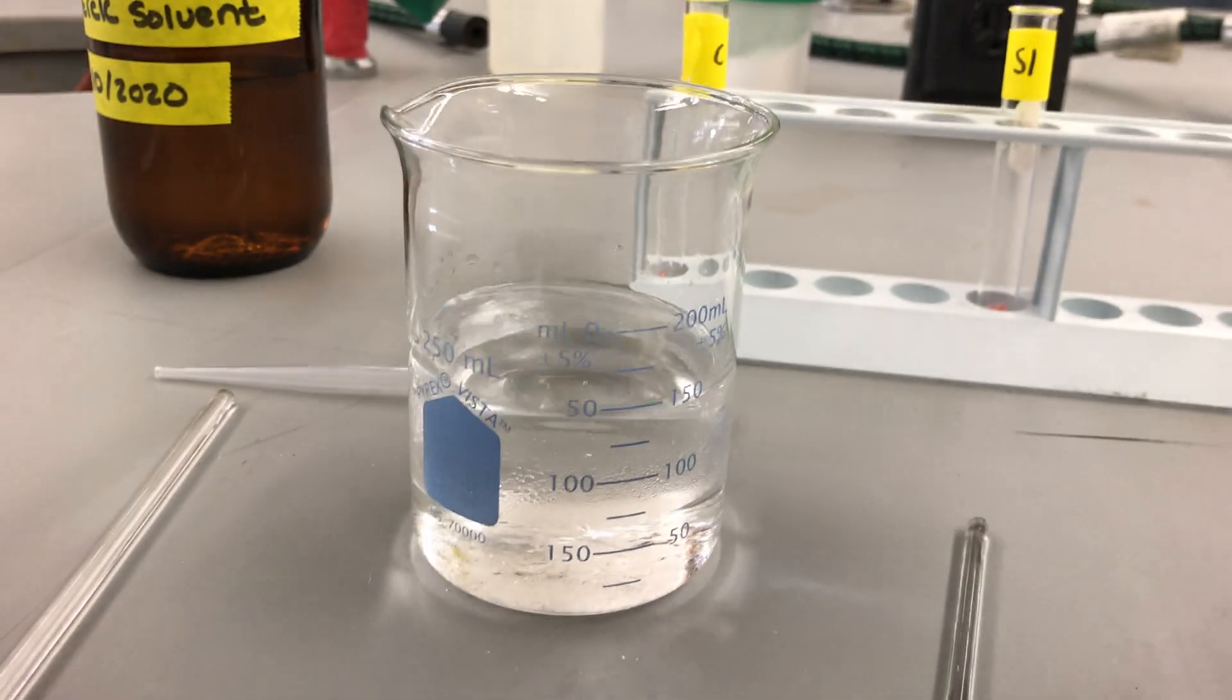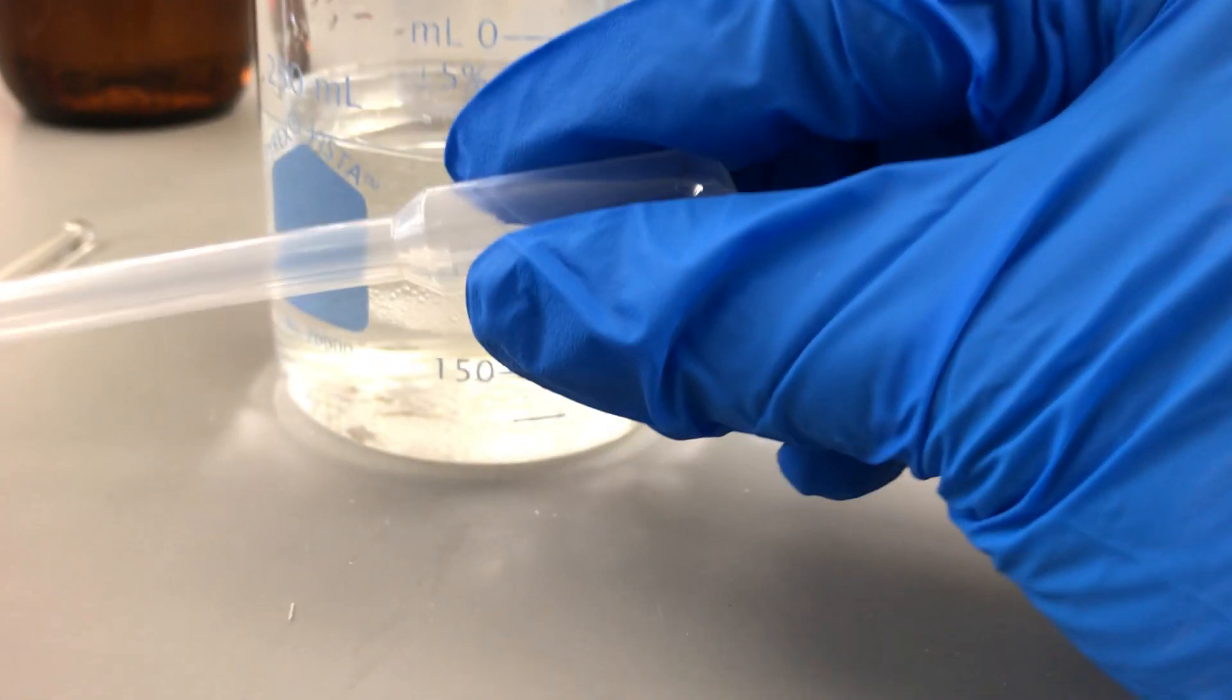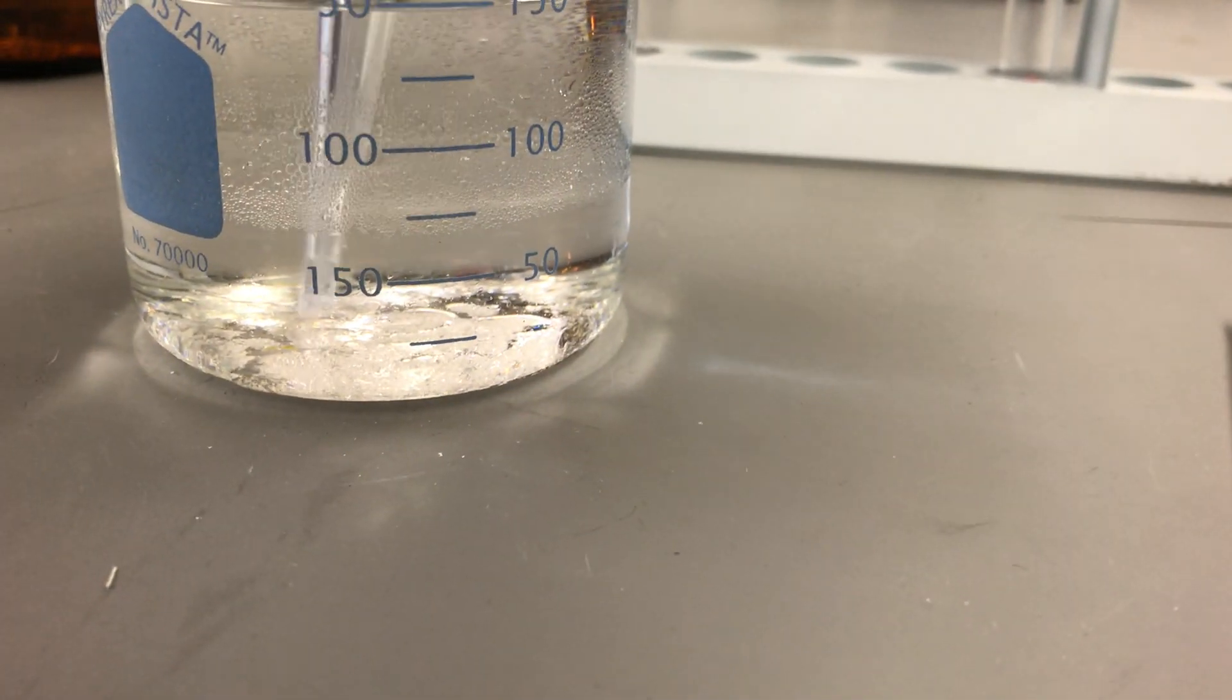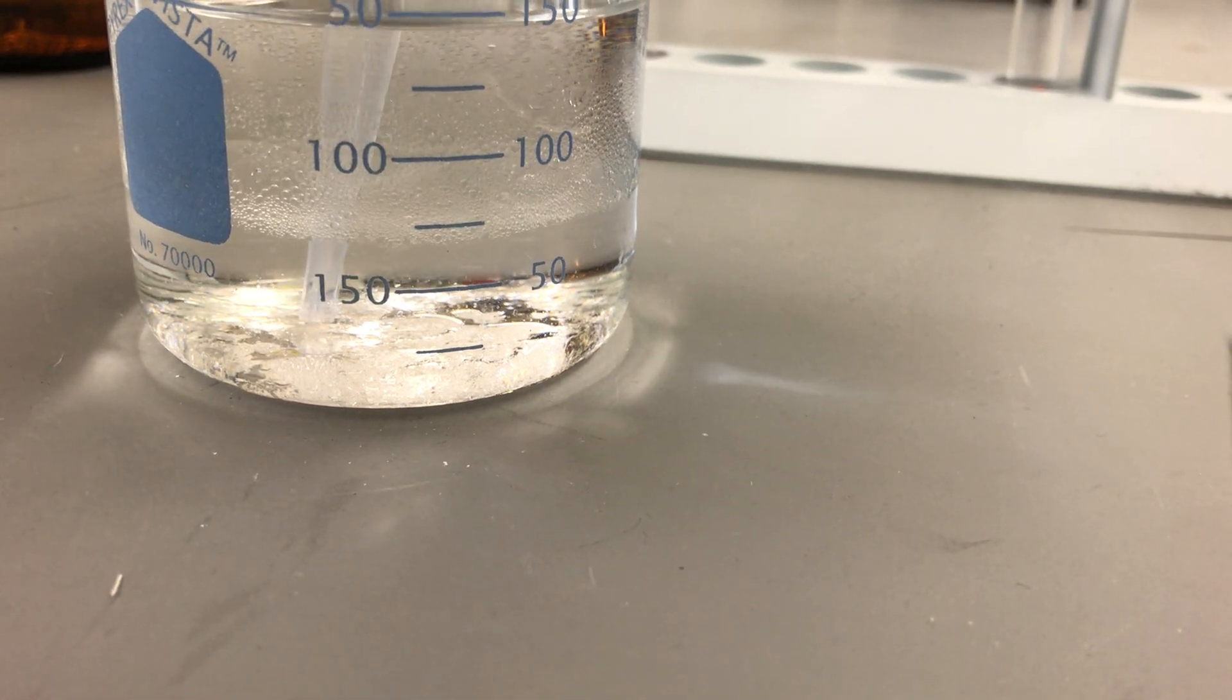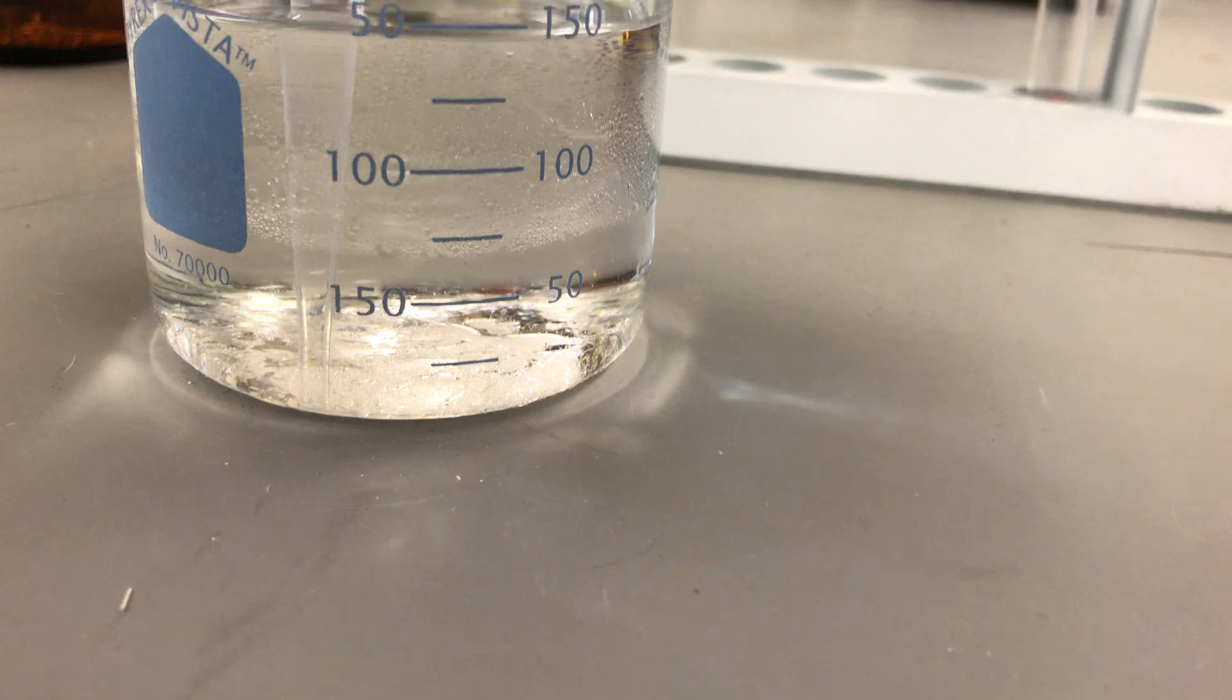Place our solvent, we have our dropper pipette. We're going to squeeze the bulb of the pipette like so, place it all the way to the bottom layer, and suck some up by releasing the bulb.